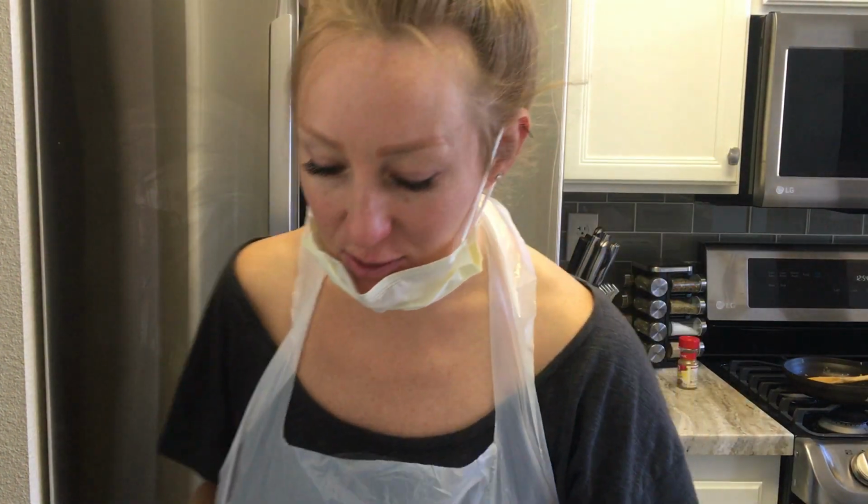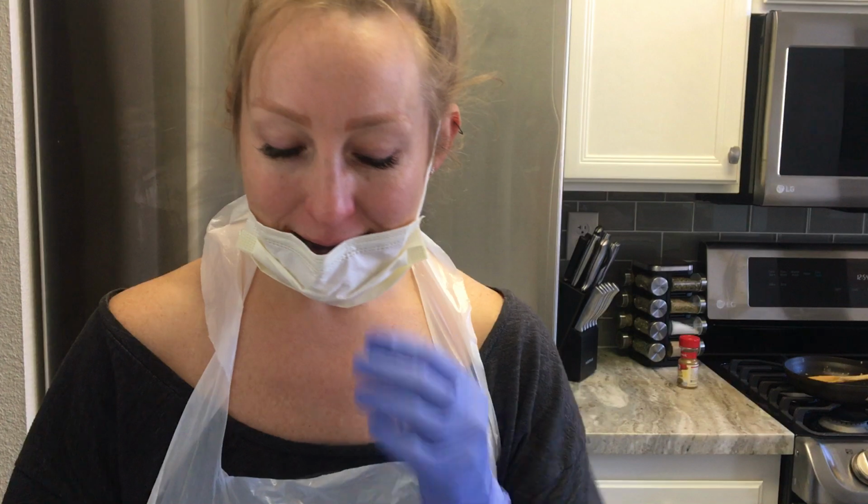Hi, Dr. Stansel. This is the final video for week 7, the antibiotic sensitivity Kirby Bauer diffusion test. Mouthful. I mentioned in the first video I'd get into a little more detail about each antibiotic.